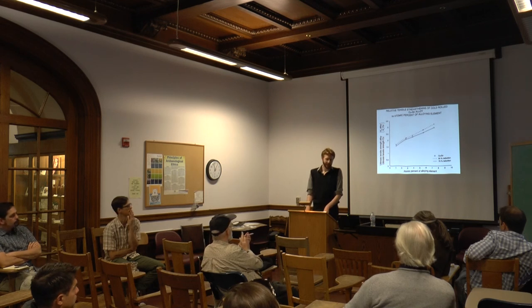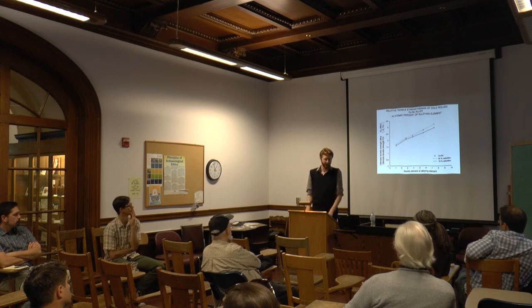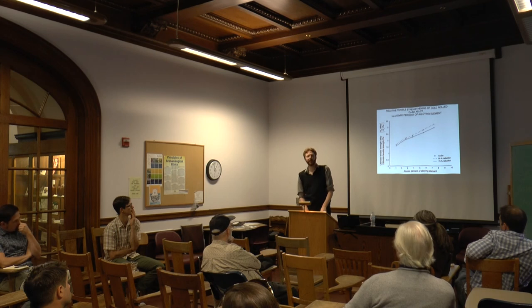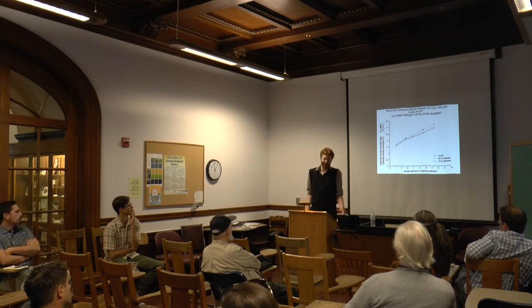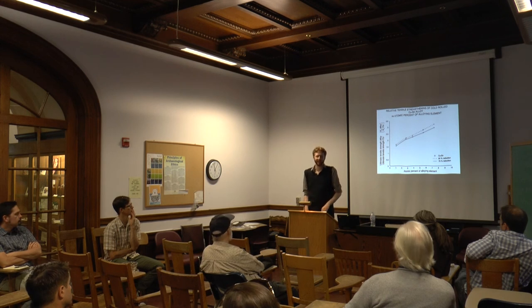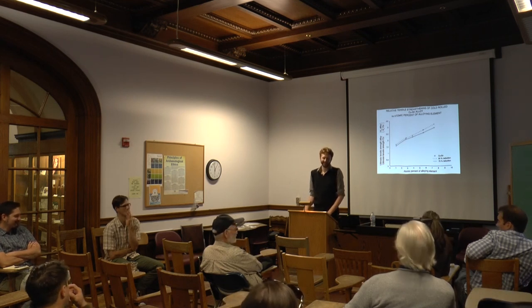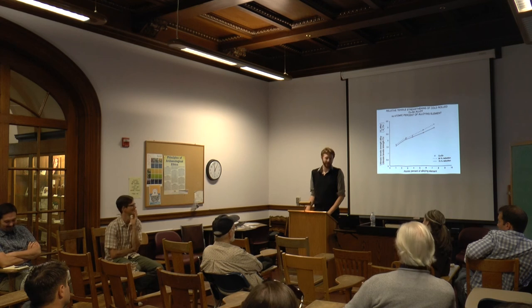What I would like to do in the future is get a standard of these elemental types so that I could use an algorithm like the one that Bruker has to figure out the exact chemical composition. Once I have that, I can test it the way you would test a bicycle helmet, and figure out if the guy fell over, whether it would cause brain damage. That's what I'd like to do in the future, but that requires more time and money.